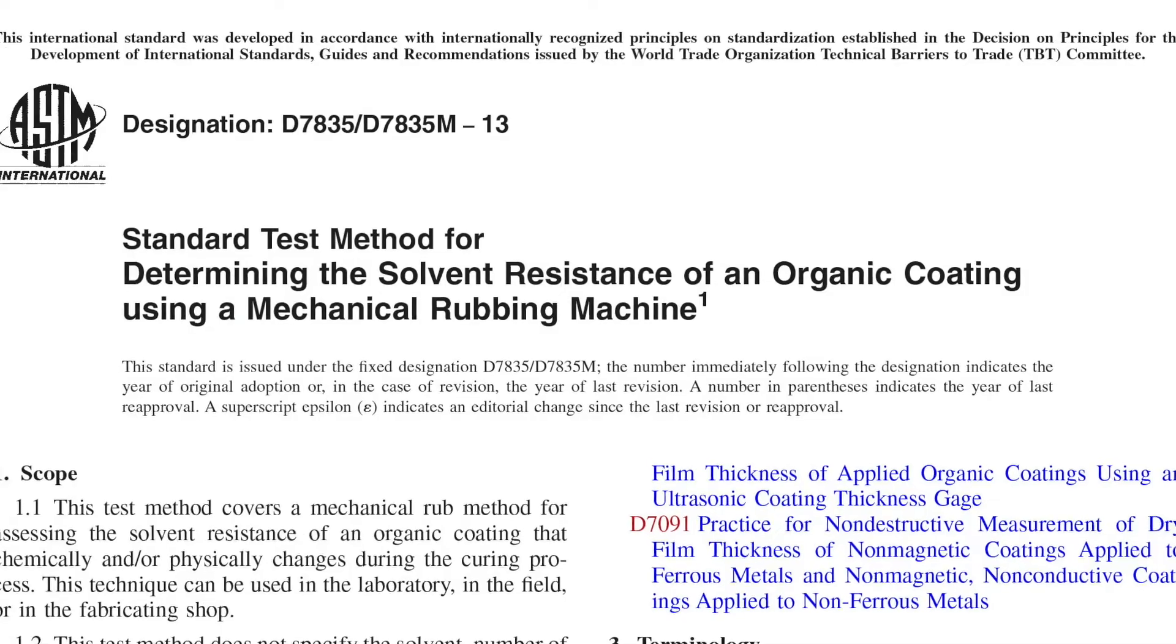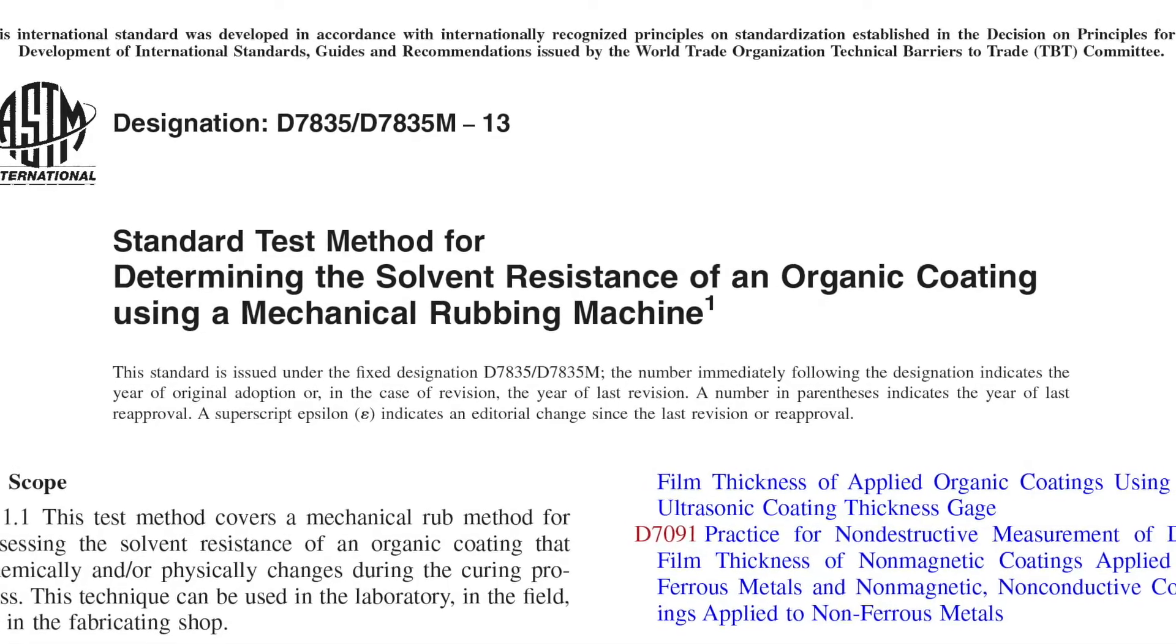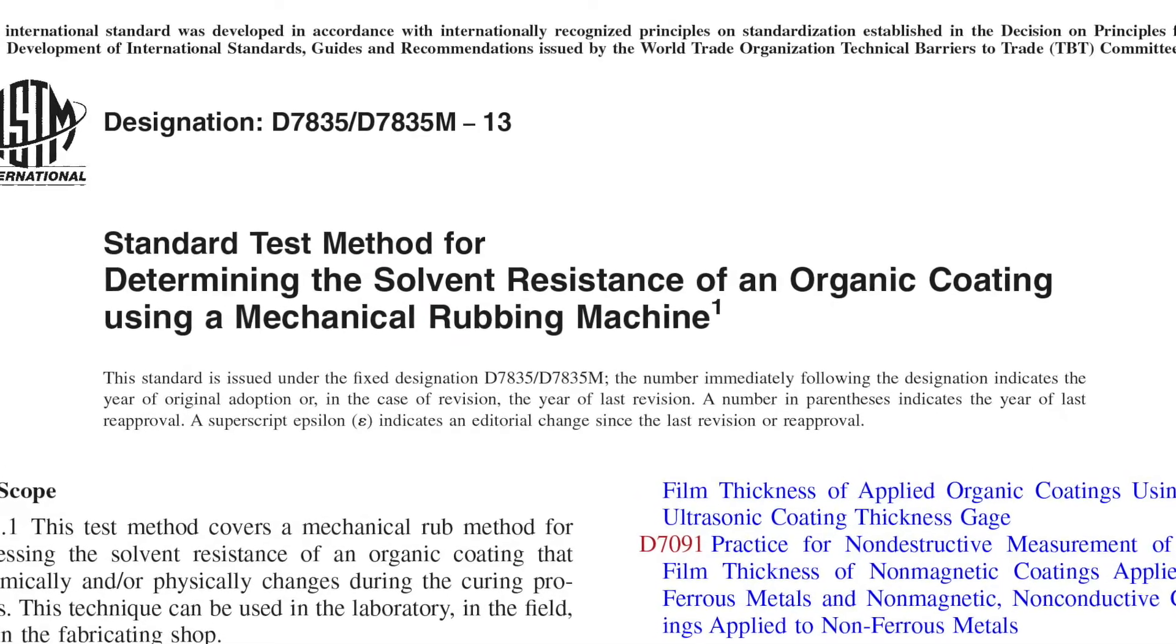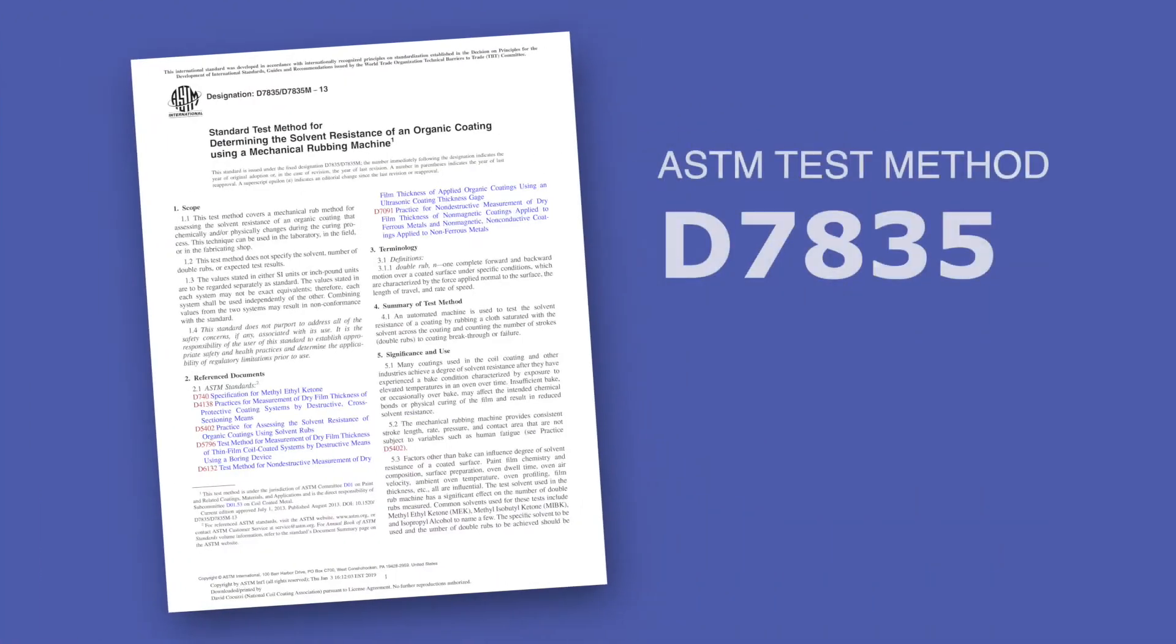This video demonstrates how to determine the solvent resistance of an organic coating using a mechanical rubbing machine in accordance with ASTM test method D7835.